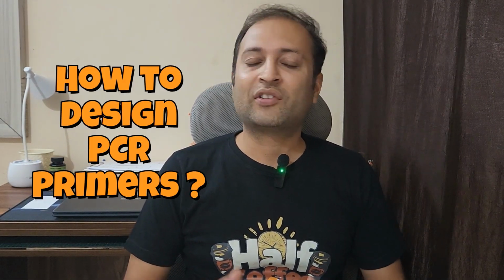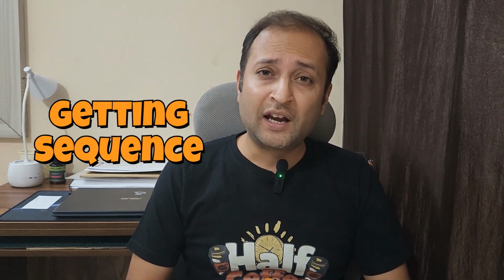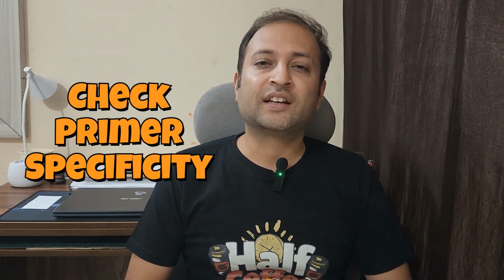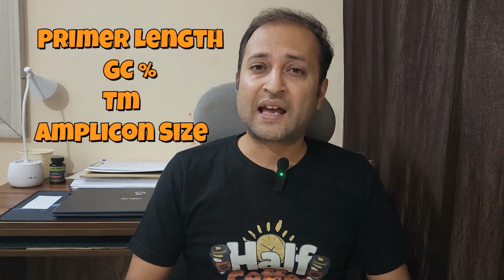If you want to learn how to design perfect primers for a standard PCR or real-time PCR, then this video is for you. In this video, I will show you the complete PCR primer designing workflow, practically and in a step-by-step manner, from getting your target sequence from NCBI to designing the primers using NCBI Primer Blast, and finally checking their specificity. We will also look at the key parameters you need to understand, including the primer length, the GC content, melting temperature, amplicon size, and primer specificity, all of which are important for designing effective primers.